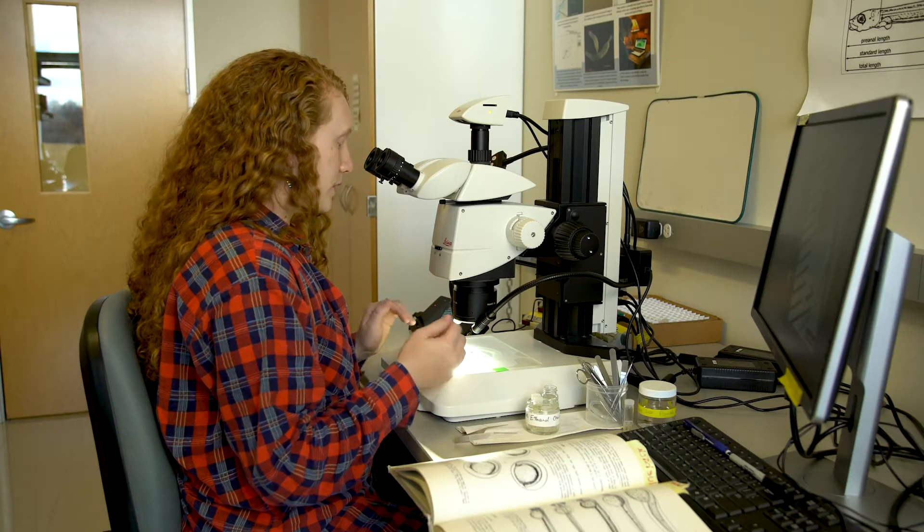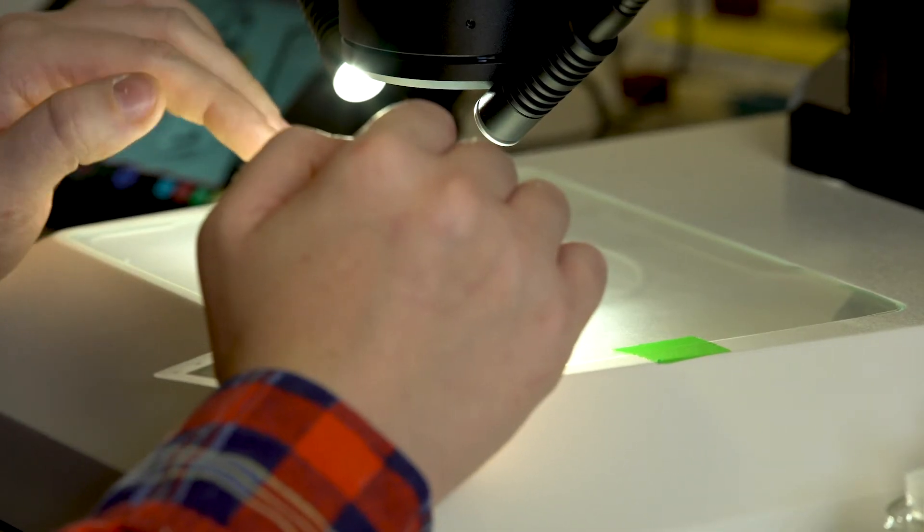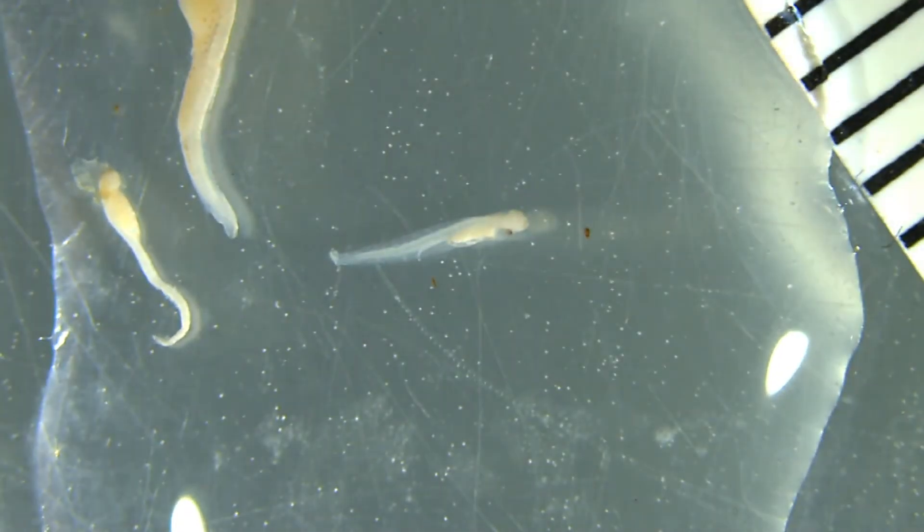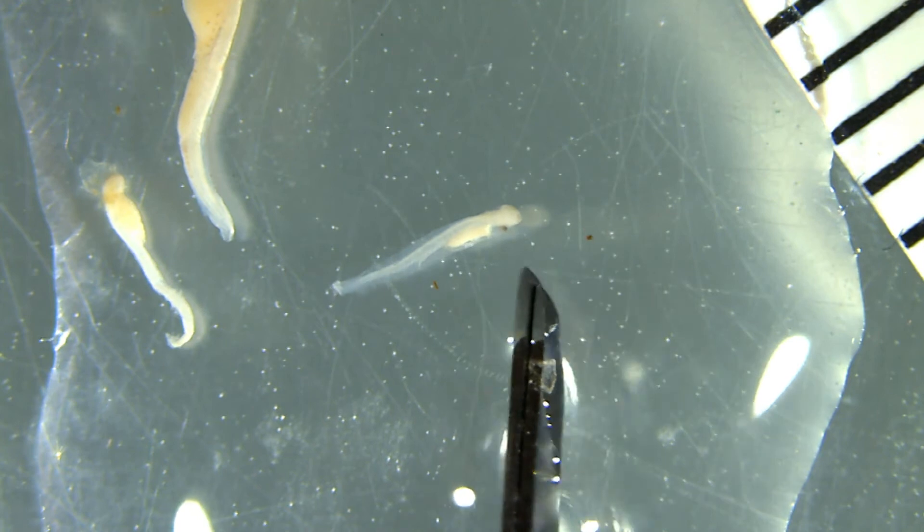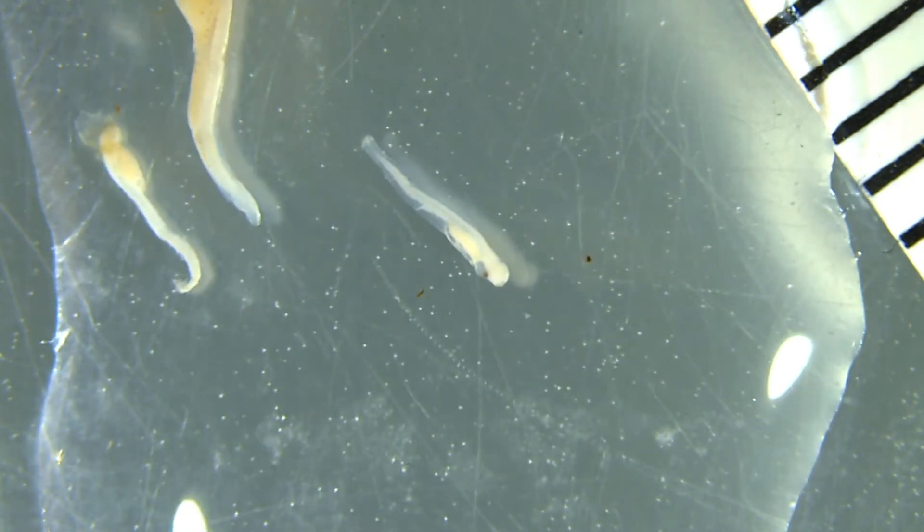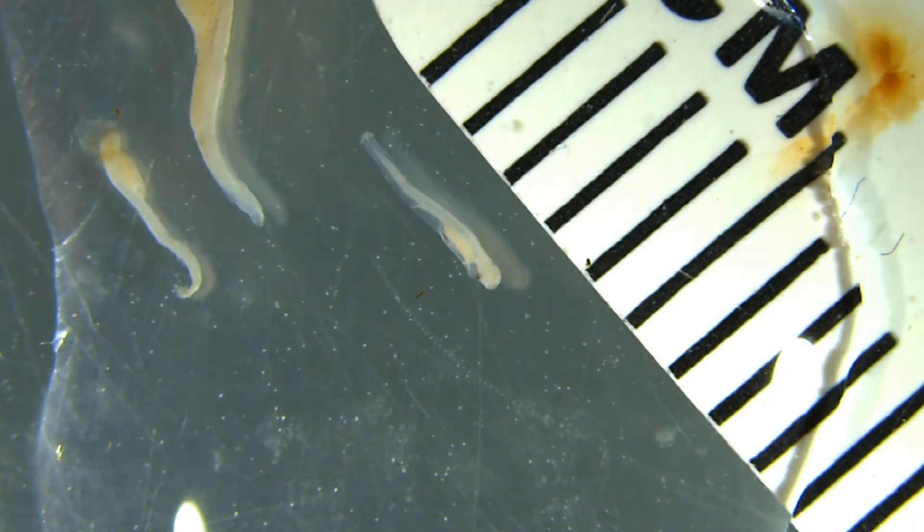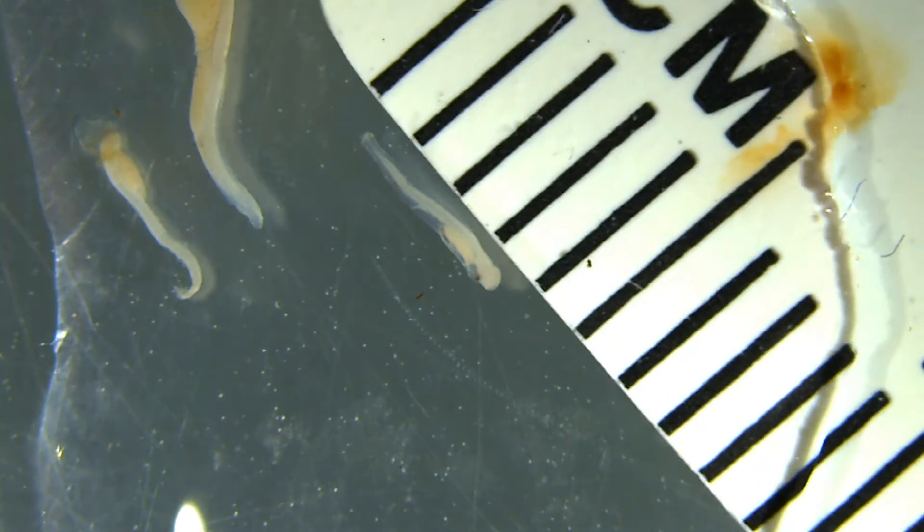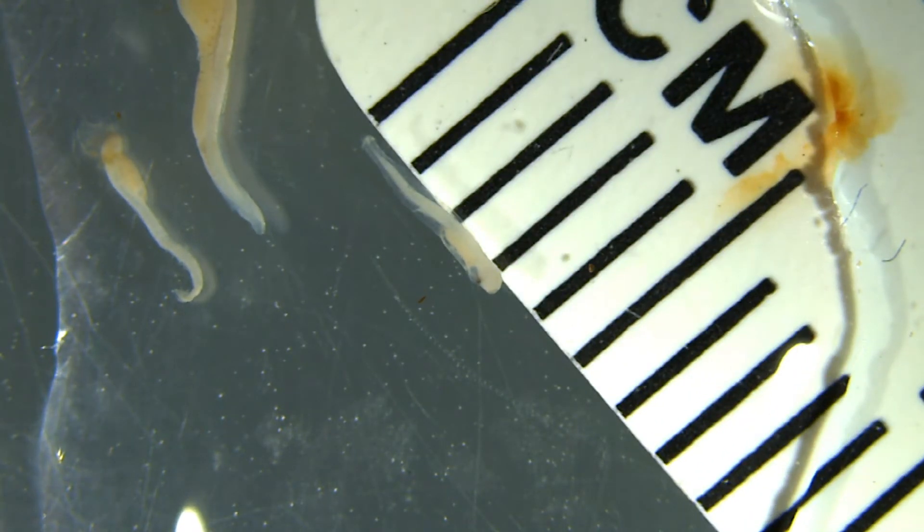Size is a really important characteristic. Depending on the family and even depending on the species, they all hatch at different sizes. So for example, this guy right here is a white perch. So his hatching size, he's only maybe hours old. He's not even four millimeters, he's three and some change.